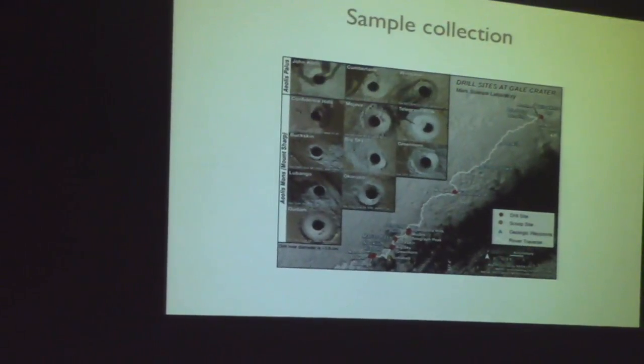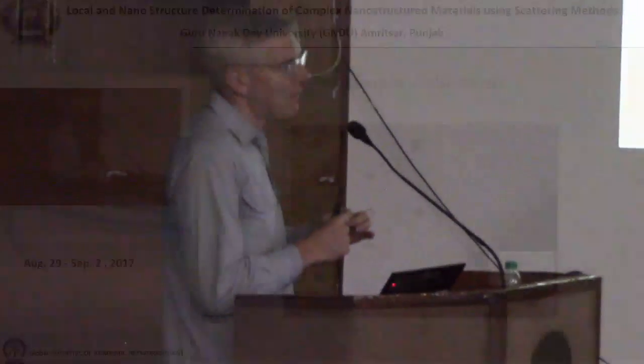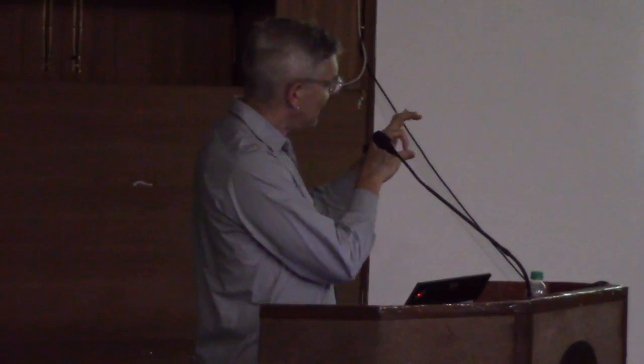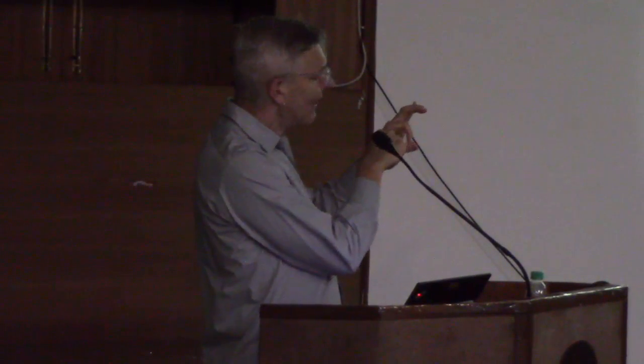They came up with a sample holder, after many trial and error attempts, that is kind of disc shaped, like a little circular sachet. Once they have the powder, it gets injected into there. But normally it would just settle down to the bottom. Since there's a very small amount of material, when they exposed this they were getting very spotty powder patterns, with a large number of spots and granules. It wasn't a good powder average.